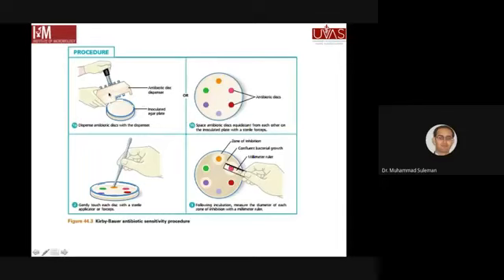So in case if you have a disc dispenser, you will place your antibiotic disc, जो आपकी tubes हैं, once you press it down, एक एक disc जो है वो नीचे से निकल जाएगी. ये आपके पास नीचे inoculated plate है agar की. You have a whole plate inoculated with the swab. आपने swab rub करके उस पे सारे पे अपना inoculum लगा दिया. The next step is you place the disc at equal space and then you press it down with the forceps.